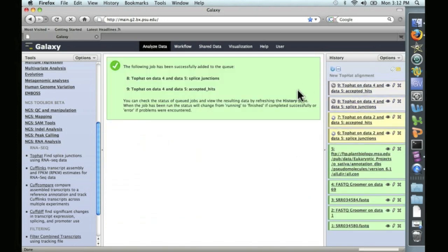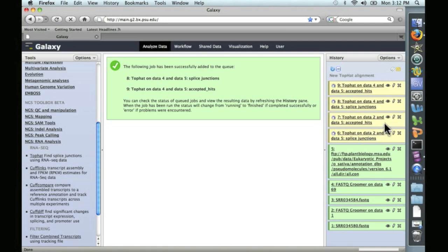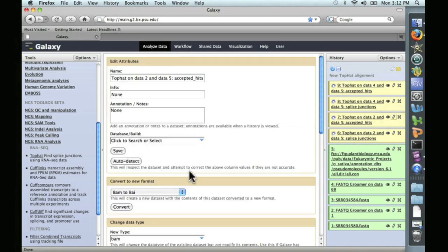These TopHat alignments are going to create two different files: Splice Junctions and Accepted Hits. We're going to work with the Accepted Hits file, which is in the BAM format. We're also going to want to take a look using IGV, as discussed in the last videos. And to do that, we'll also need a BAI file.